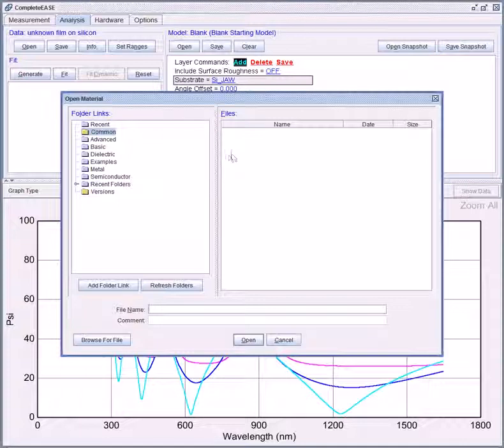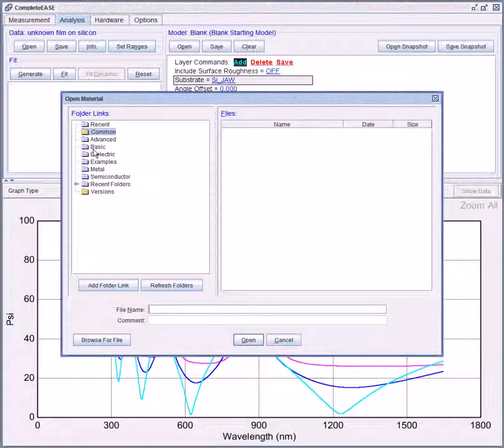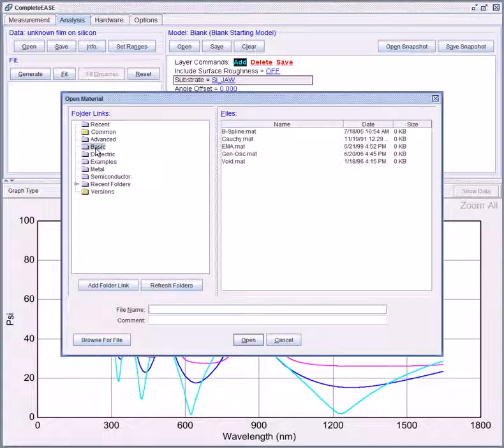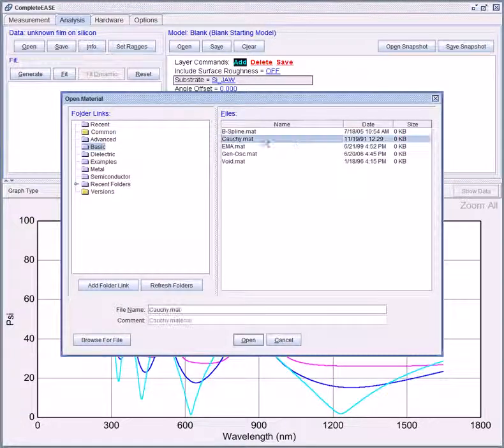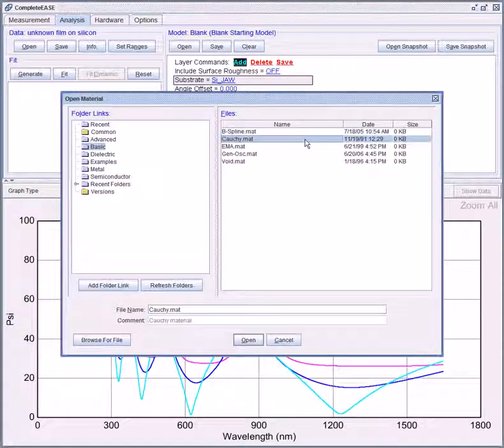Because we know this is going to be a transparent material we are going to use the Cauchy equation which is found in the basic folder. The Cauchy equation is a common choice for transparent materials.